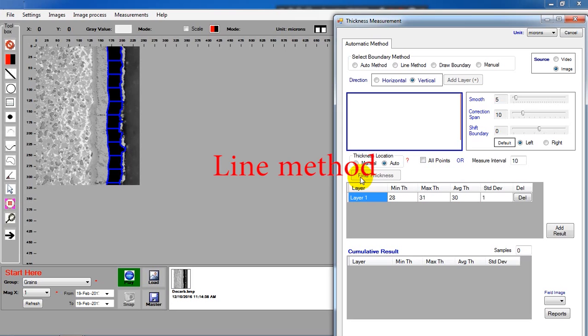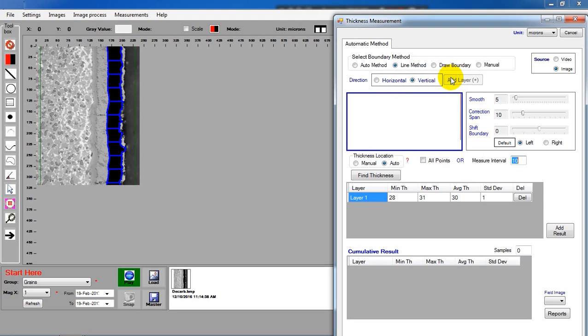Line method. If you choose line method, system will create two lines. Use the mouse to drag the lines to define the boundary.